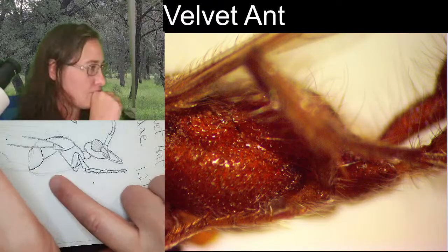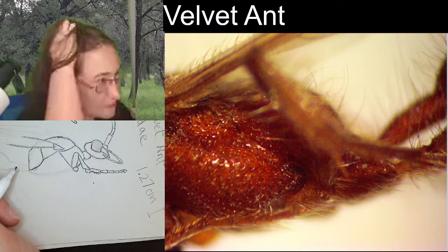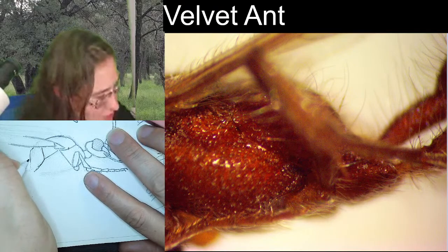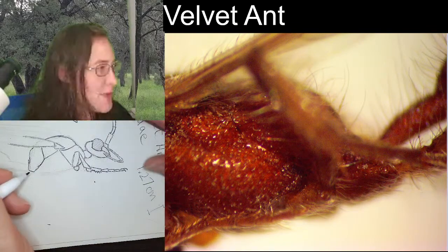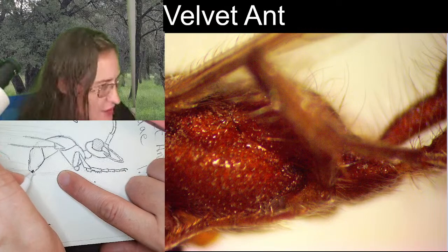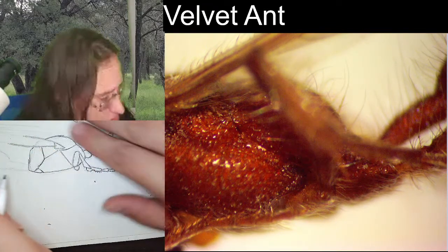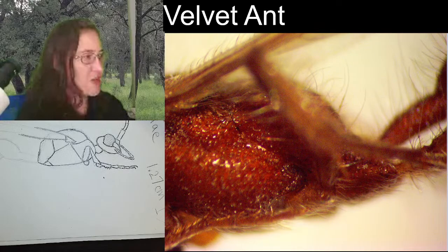So, right around there, there's a part of me that wants to bring this down a little bit more so that there's a little bit more region for this hind leg, and then this is going to be where the middle leg is connected, and we've got this little triangular piece here. That's going to be the coxal segment, and then the rest of this is just the bottom of the mesosoma. So this right here, that little triangular piece, that's the hip, that's the coxa.